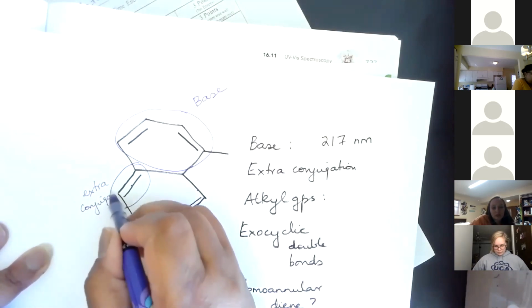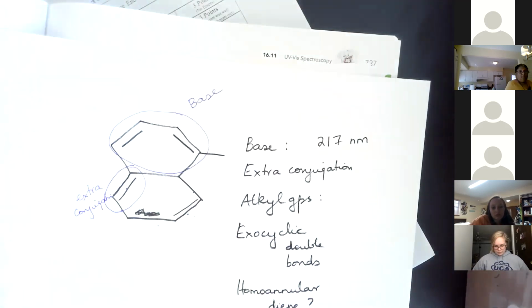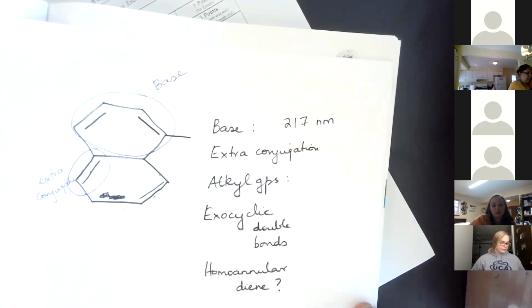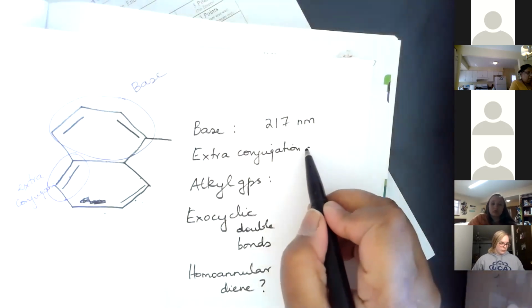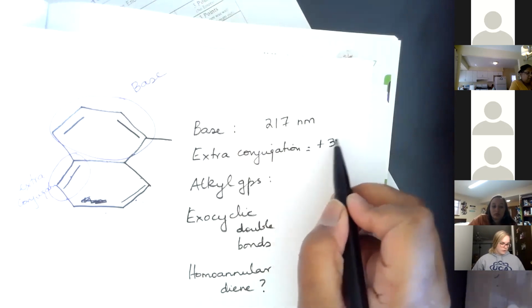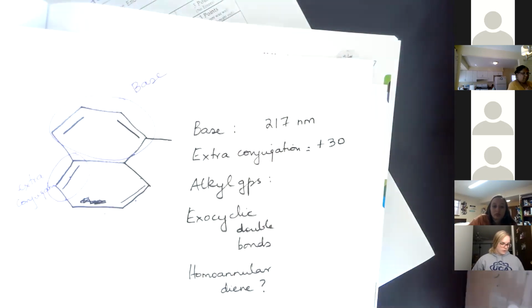Okay. So this would be, what is it for extra conjugation? Plus 30. How many alkyl groups?